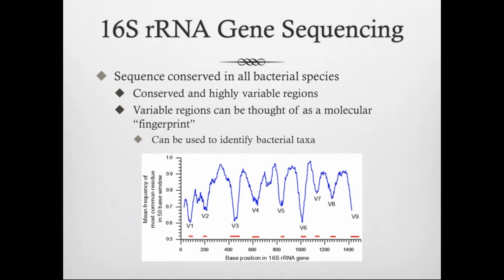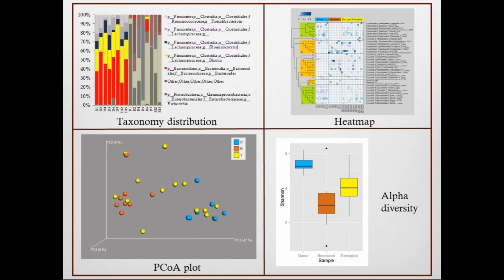And so we can pull out the 16S gene by using primers that are shared between all prokaryotes, but then between those primers is unique sequence that characteristically identifies particular species of microbes. So you use the common primers, and then you sequence everything in between those primers, and the sequence you get back will give you a profile of all the microbial organisms that were present in the samples that you were looking at.